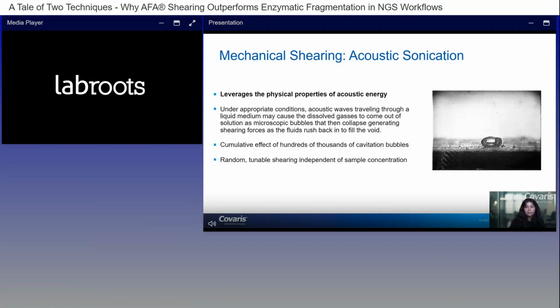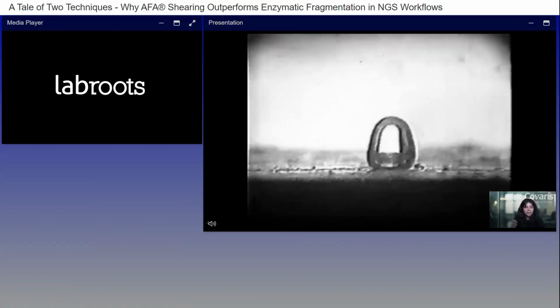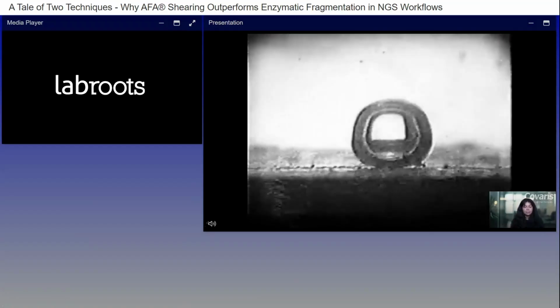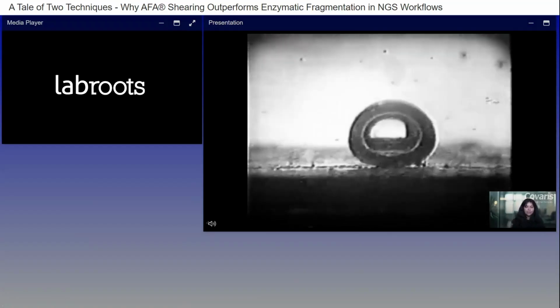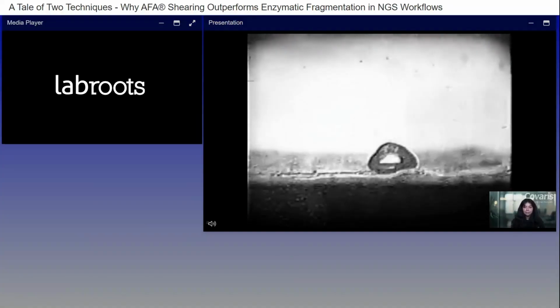So I'm going to show you a video here. And this video is just one cavitation bubble. But you can imagine that when you're sonicating your samples, it is the cumulative effect of hundreds and thousands of these bubbles that are processing your sample. So by manipulating acoustic energy, we can provide random, tunable shearing that is independent of sample concentration.